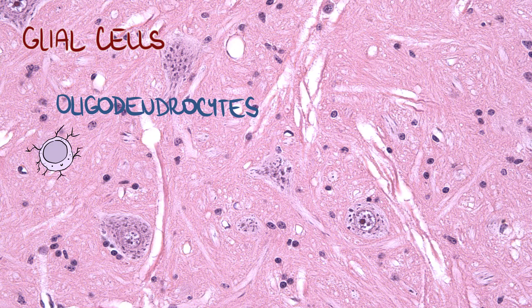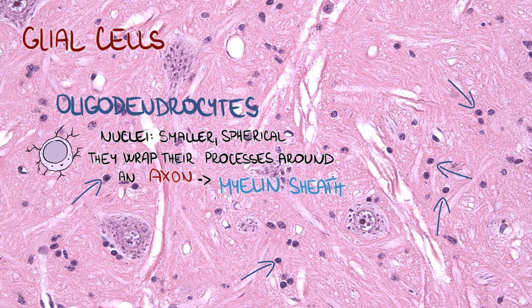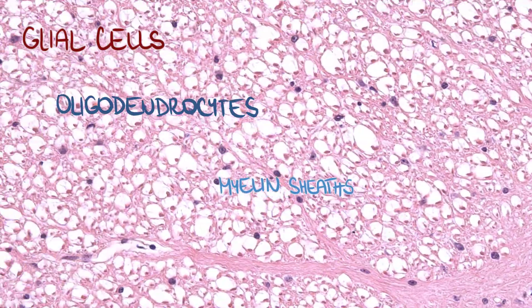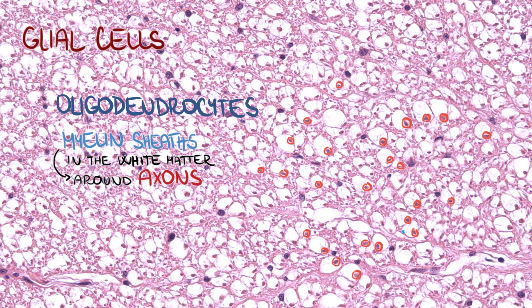Oligodendrocytes have smaller spherical nuclei. These cells wrap their processes repeatedly around a portion of a nearby axon in the central nervous system and create a myelin sheath. Myelin sheath is important for the conduction of a nerve impulse in the axon. We can see myelin sheaths in white matter here — these are the axons with myelin sheath around. Axons should be in the center, but they moved a little bit because of the preparation of the slide.